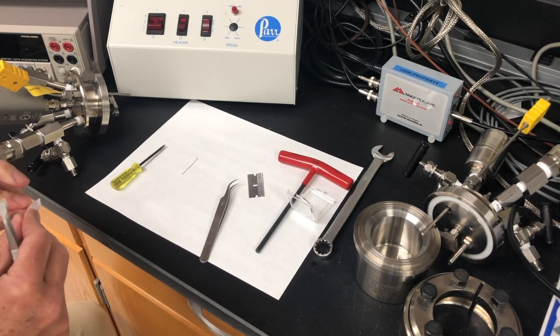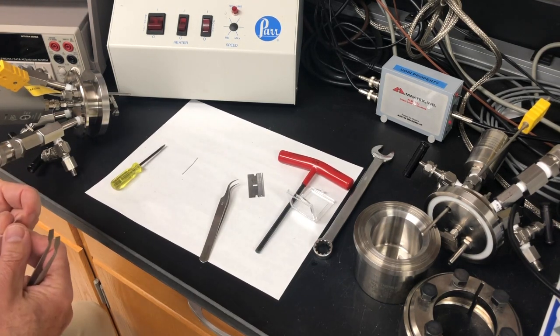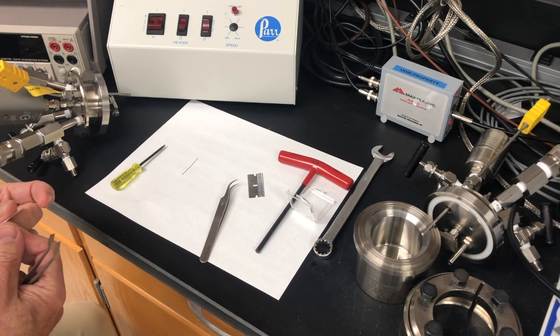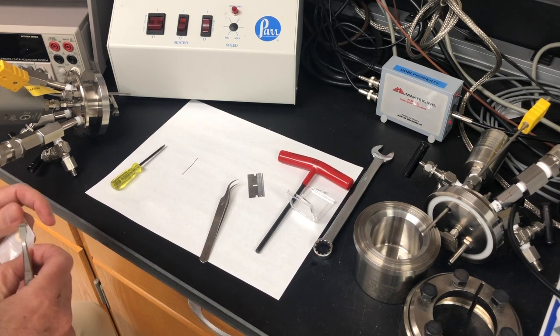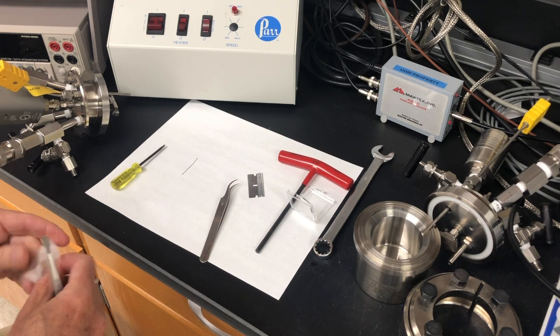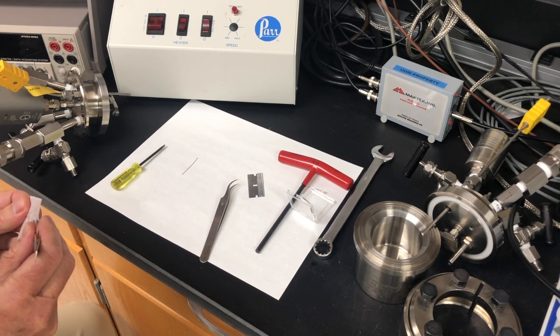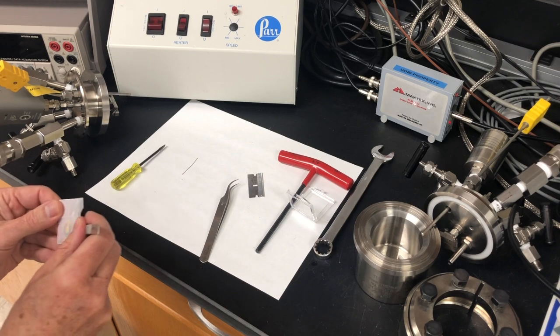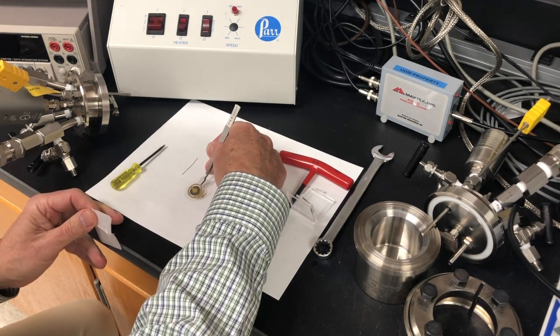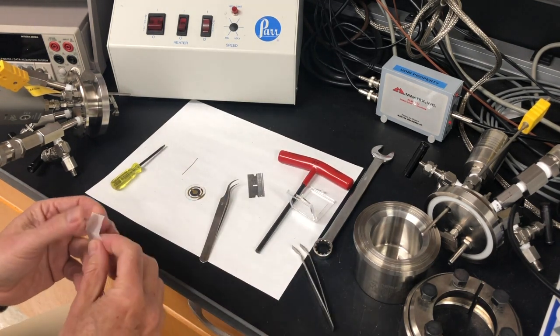And now we take out a brand new QCM crystal using tweezers, making sure not to touch the crystal with our hands. We place the crystal with the small round electrode facing up. Notice that the wraparound electrode is on the right and the small round electrode faces up.